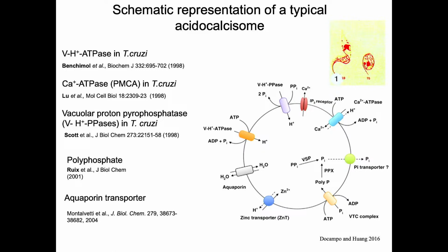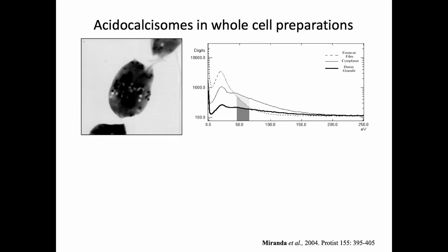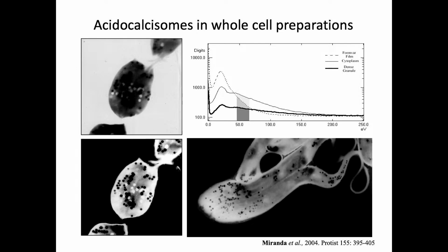So if we look at the electron microscope, these cells are thin enough to be seen as a whole mount in the microscope. So Grant was mentioning whole cells, right? But if we use an energy filter and tune the contrast, instead of looking only at zero-loss imaging, we can improve a lot both contrast and also chromatic aberration.